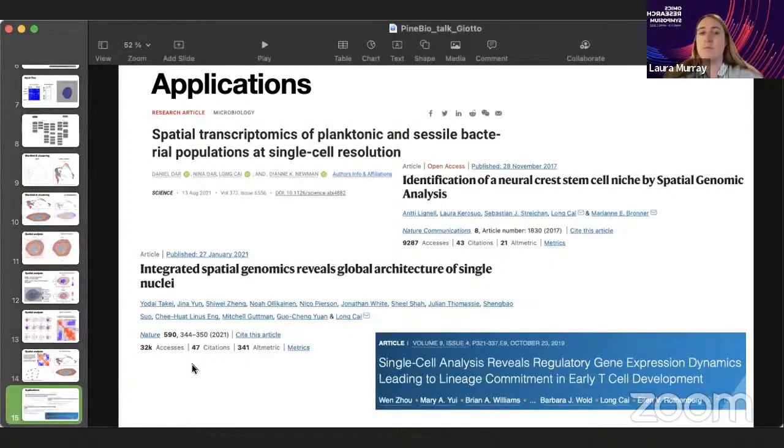The first question is, how do you select between various manifold methods when analyzing complex data, such as spatial single cell?